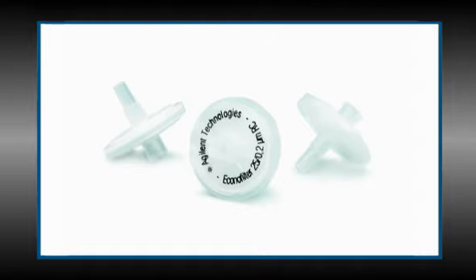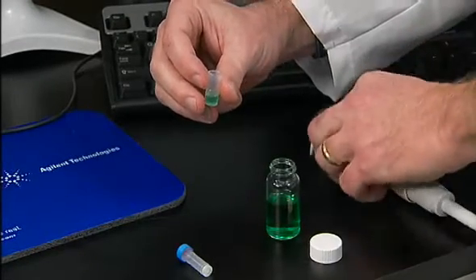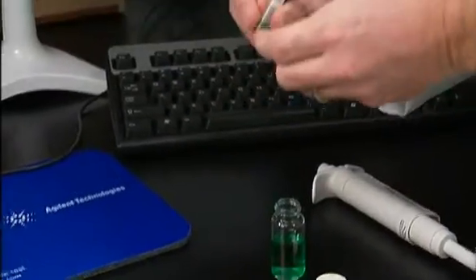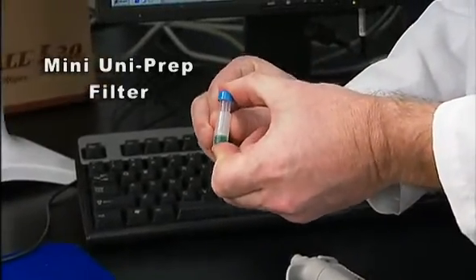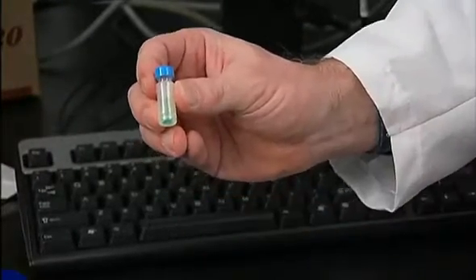To prevent buildup of contaminants, one can use filtration of buffers, solvents, or sample to remove particulates from reaching the column. A wide variety of filters are available. Syringe filters of varying diameters and varying materials of construction, the mini UniPrep filter that permits filtration in an autosampler vial, individual filter membranes that are placed in a reusable filtration setup, or glass, paper, or ceramic filters, which are used less frequently. When using membrane filters, make sure that the polymeric material is compatible with the mobile phase and sample solvents. Otherwise, you may further contaminate your system or sample by having dissolved material from the filter.